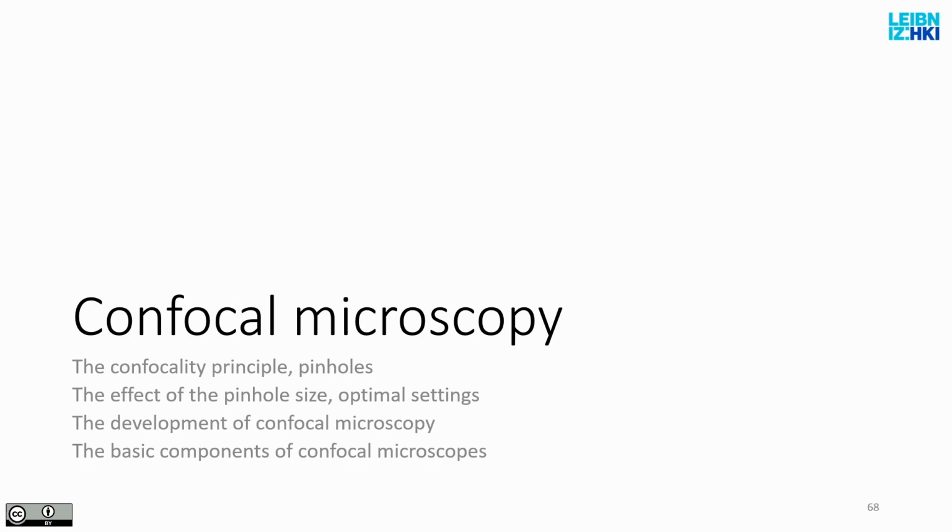You saw the example of the fungal hyphae, where I showed you the effect of the deconvolution. These images, when you take an image at any focal plane, will contain a lot of blurred parts because you detect signal from the part of the sample which is not in focus. And this means that part of the image will be sharp and part of the image will be blurred.